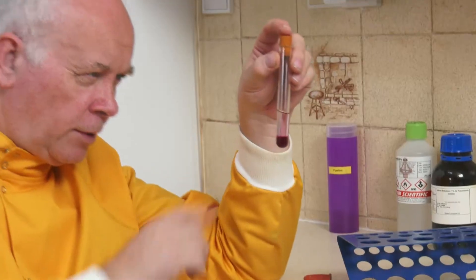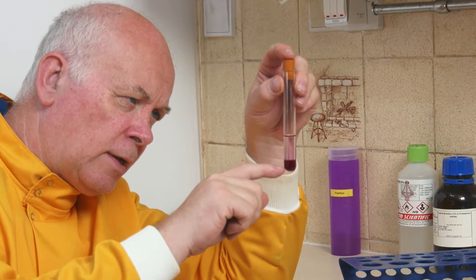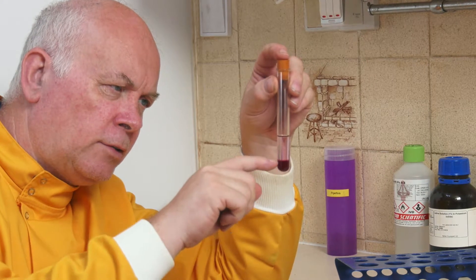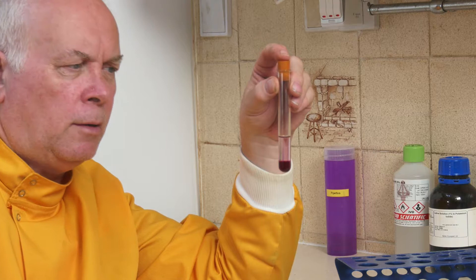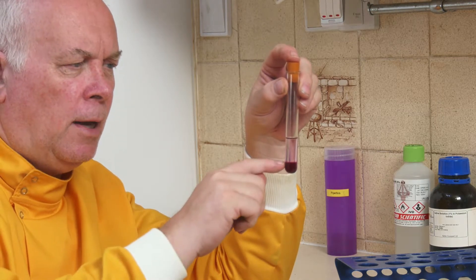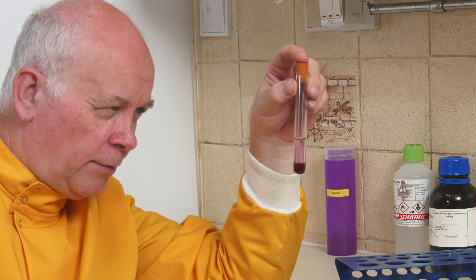So we've got a nice clear layer of cyclohexane. We've got this iodine dissolved in KI — iodine doesn't dissolve in water very well so we've got it dissolved in a solution. We've got a lot of potassium iodide and there is this purple band at the very bottom.